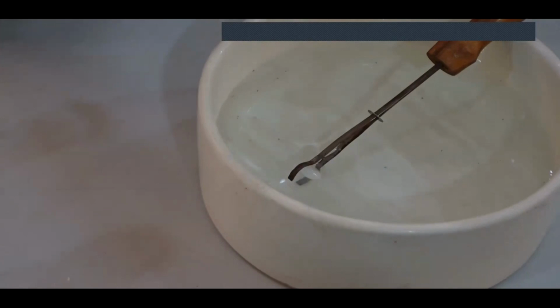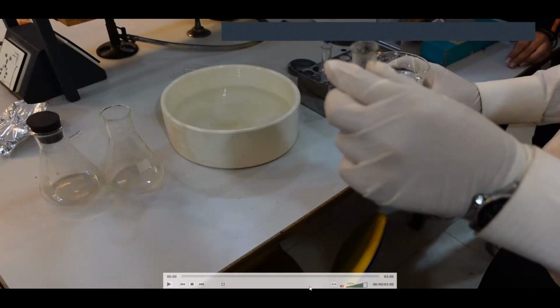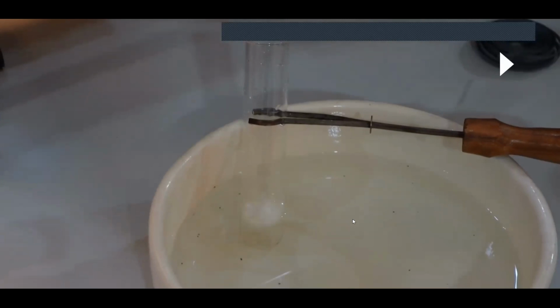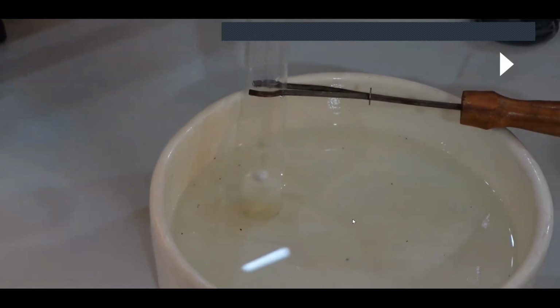So I added it to water because I wanted it to cool down right away. Any observations about that reaction, the one that we had with the acid? The moment I add it, there's a lot of bubbles, as you can see. And then there's metal still floating on the surface. And then there's a spark.